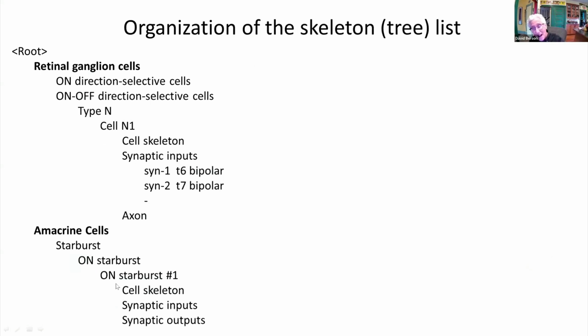When I'm working, I really want to be organized about which entities I have and where they go. And of course, in WEBKNOSSOS, there's a whole hierarchical directory structure in which you can insert things. So for me, a chunk of my directory structure might look like this.